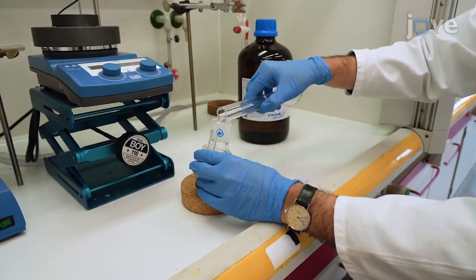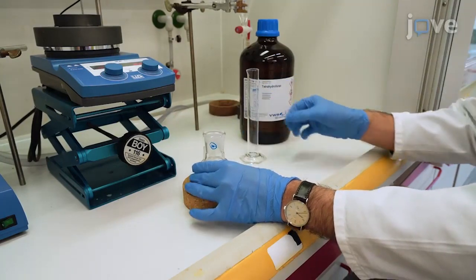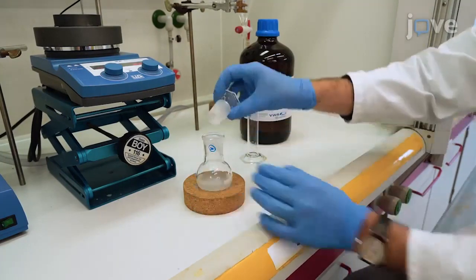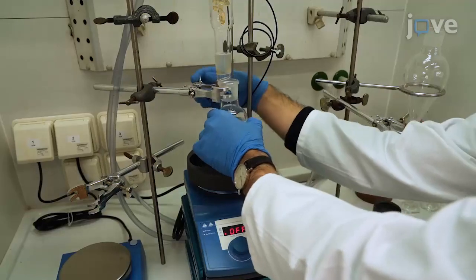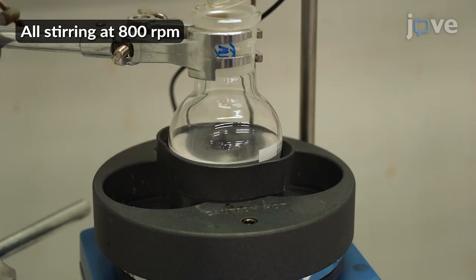To begin, place 2.46 grams of bock-protected L-glutamine and 50 milliliters of tetrahydrofuran in a 100 milliliter round-bottom flask and stir at 800 rpm for 1 minute.